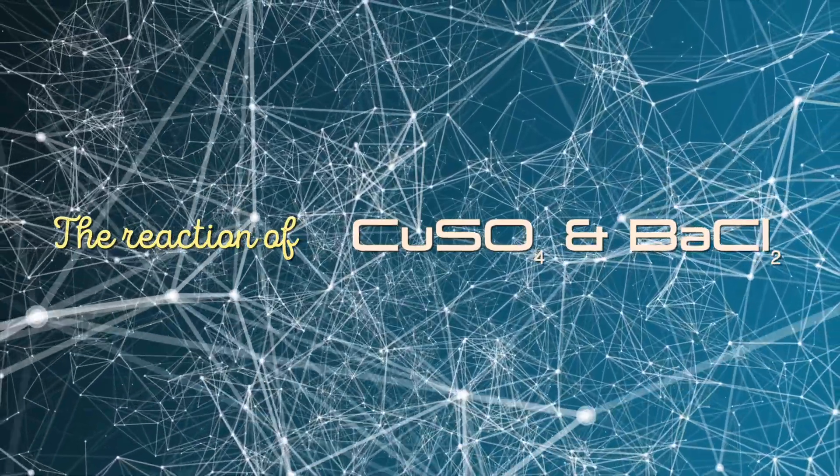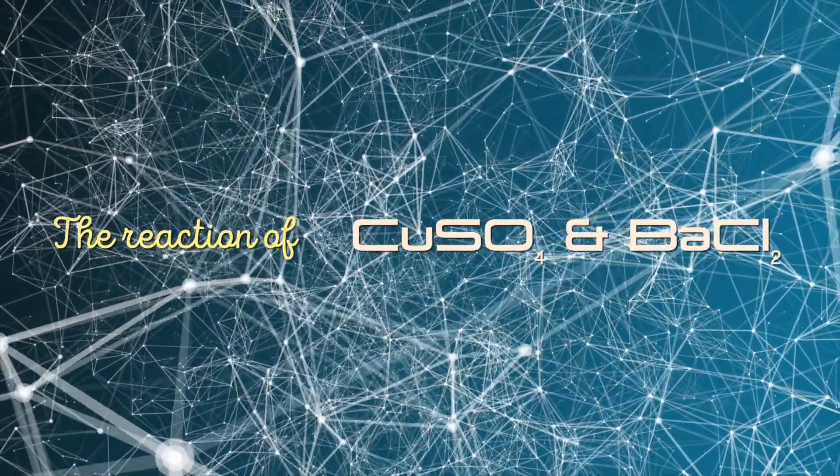Today we are going to observe the chemical reaction between copper sulfate and barium chloride.